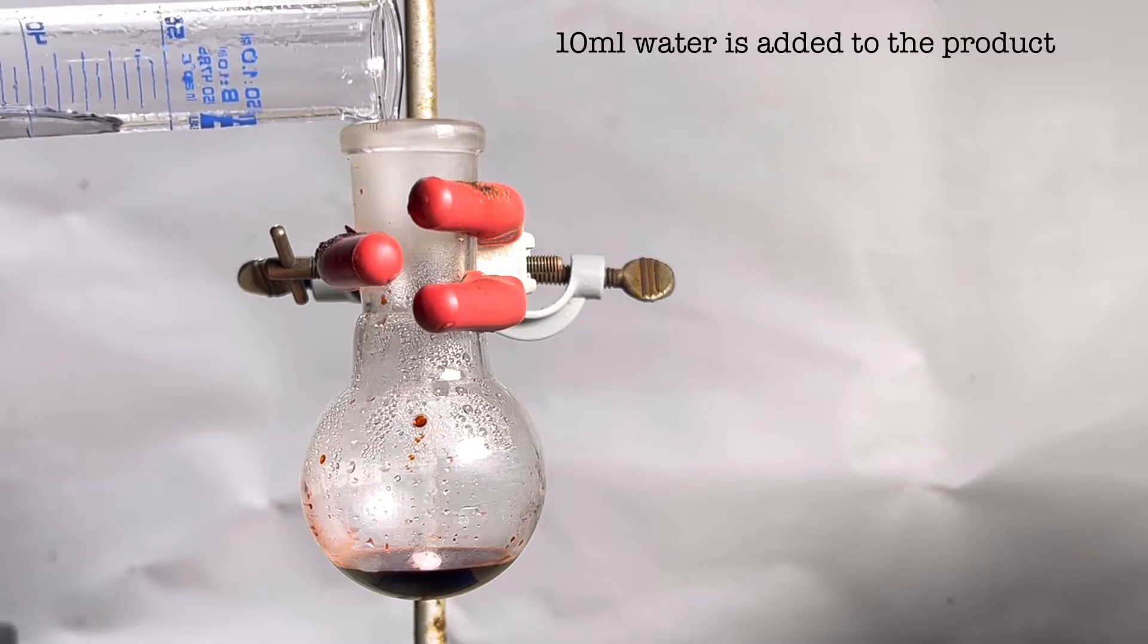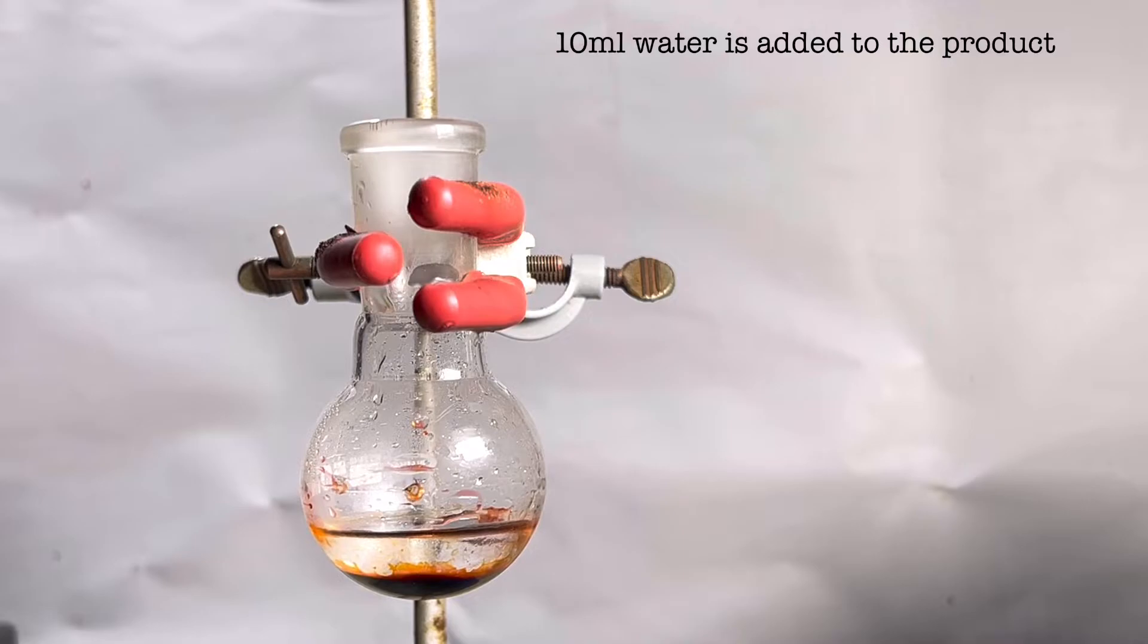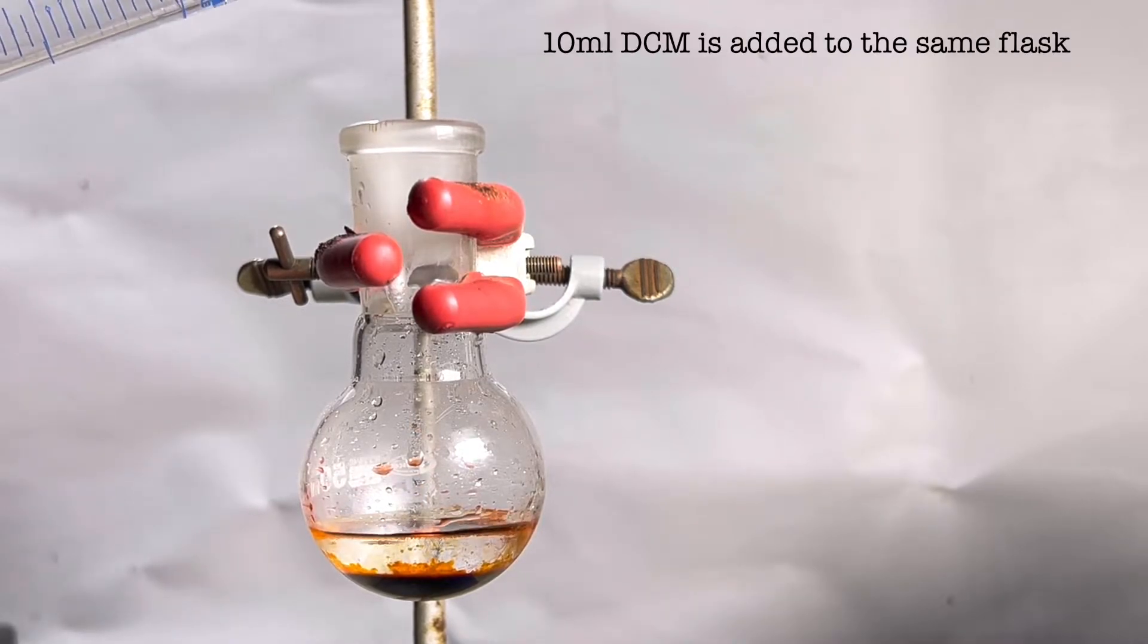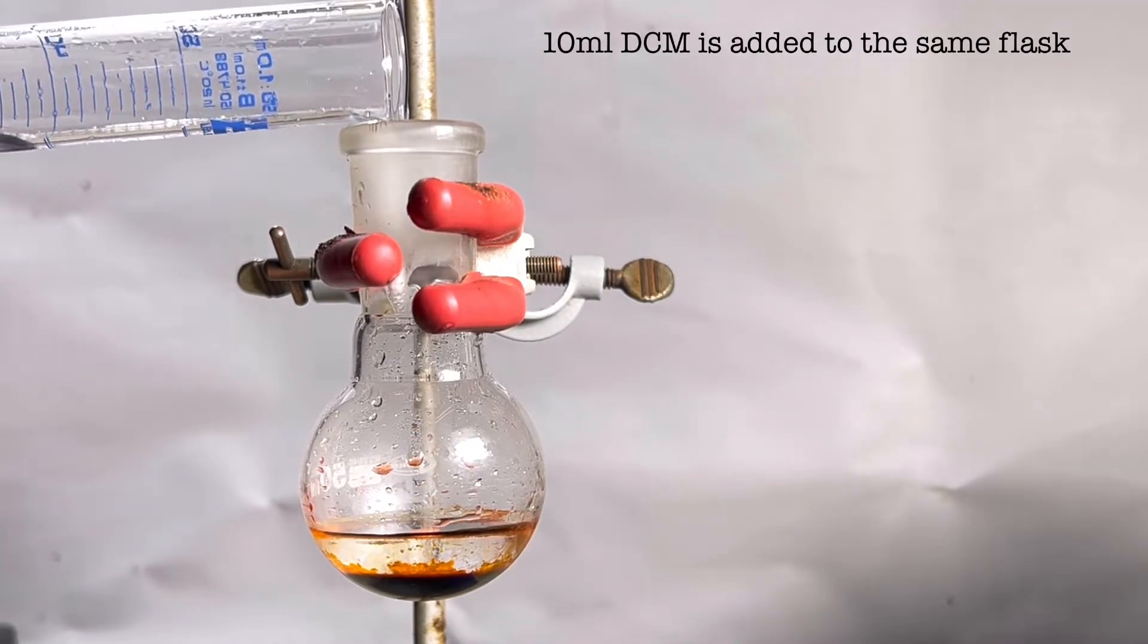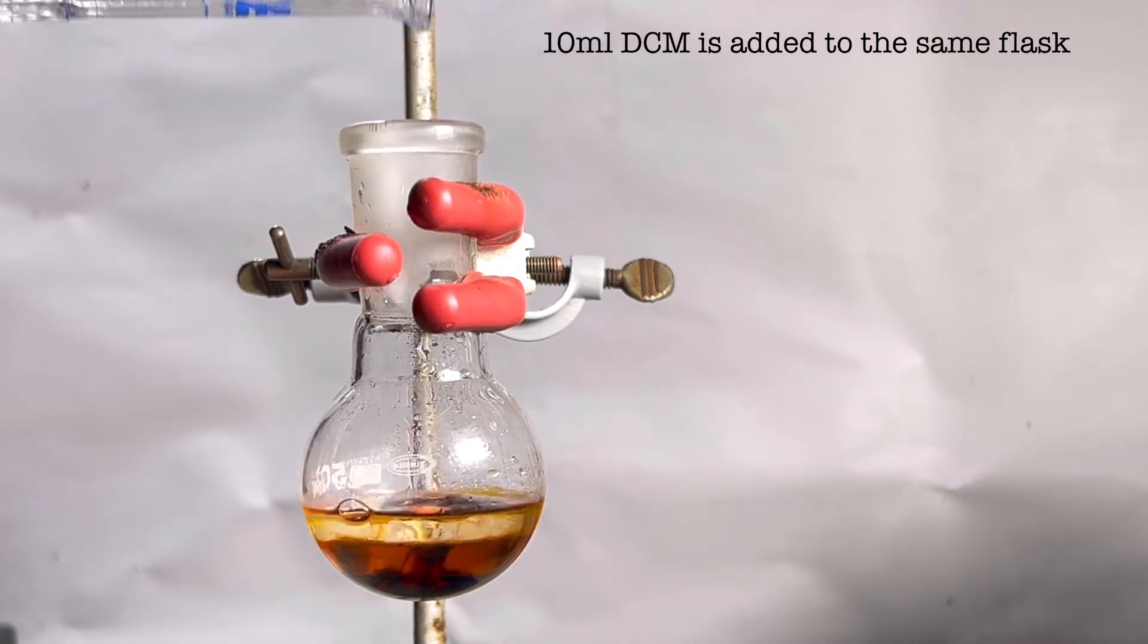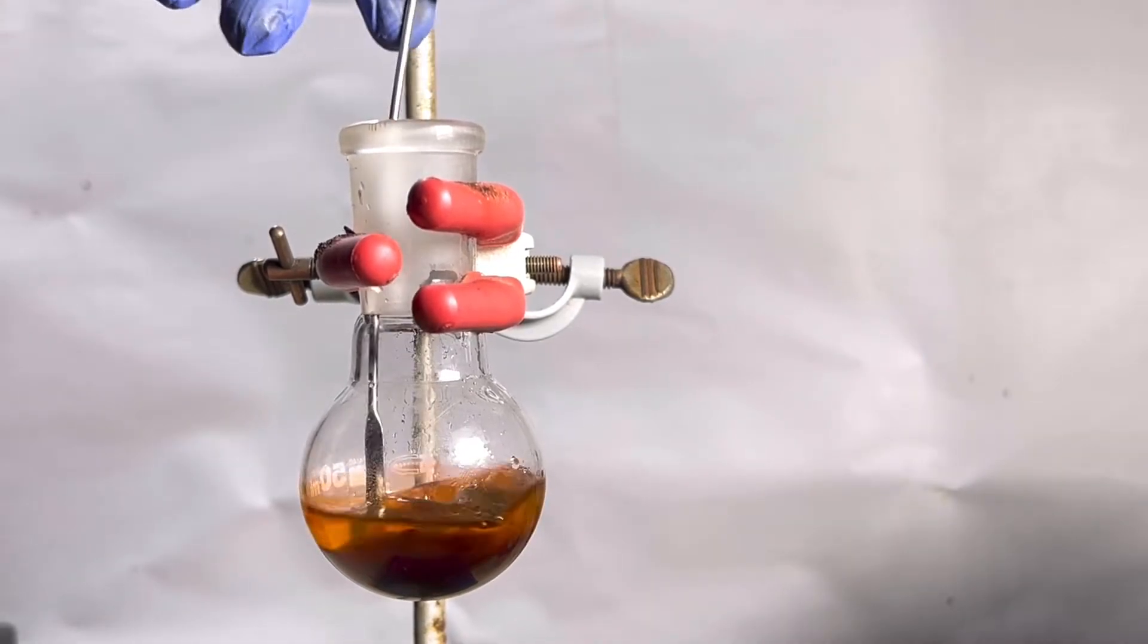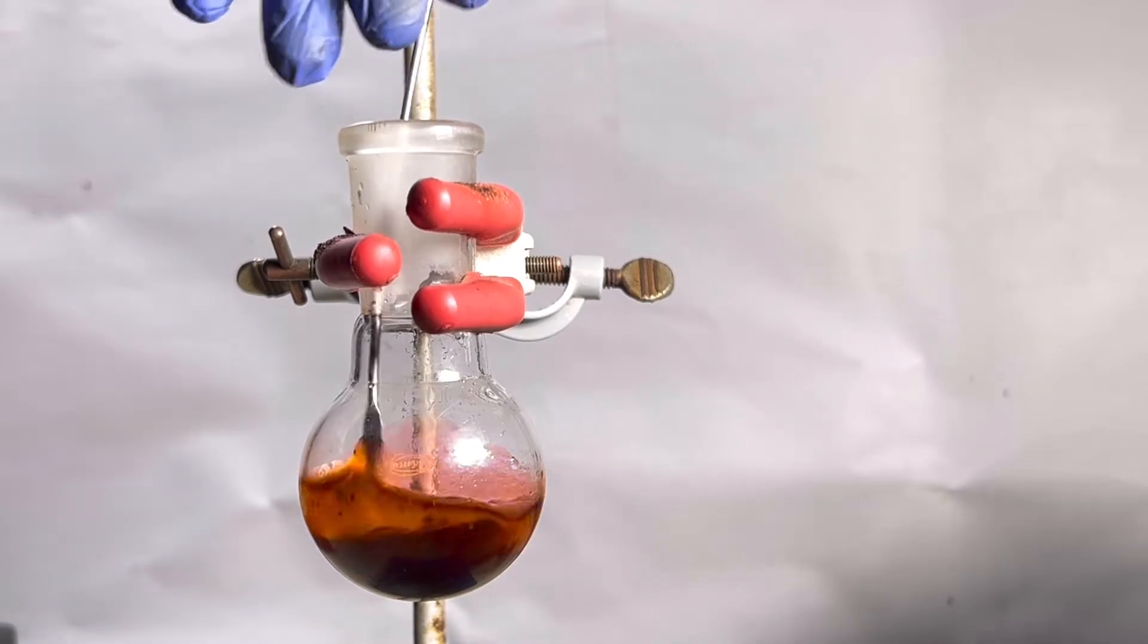10 ml of distilled water was added to the round bottom flask. This was followed by the addition of 10 ml of dichloromethane. Now the solid bottom layer was broken up using a spatula. This helped the stirring bar to stir as it was stuck in the solid.